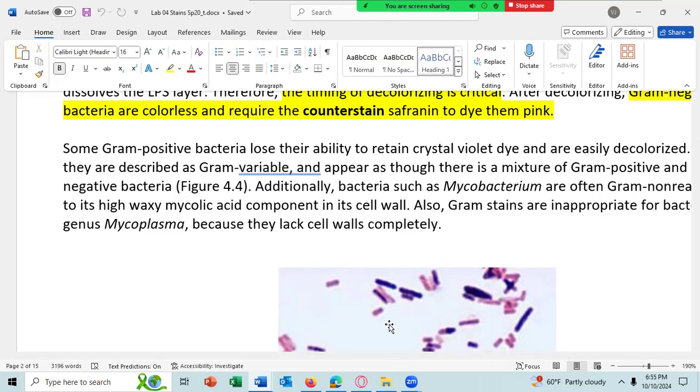And they've always told me, oh, these cells are 2 weeks old or older. And I inform them to do the gram stain correctly, you have to use it on freshly grown cells. If the cells are older than 2 days old, the gram stain may not work.